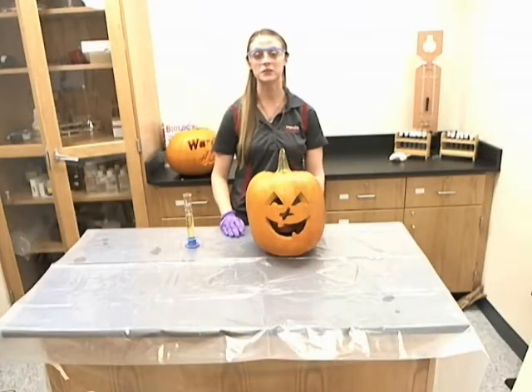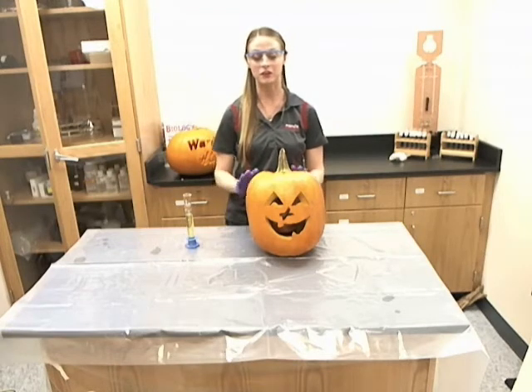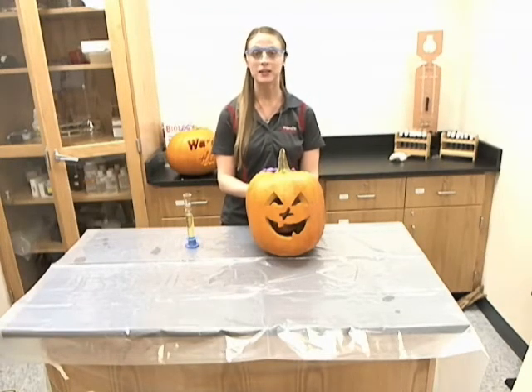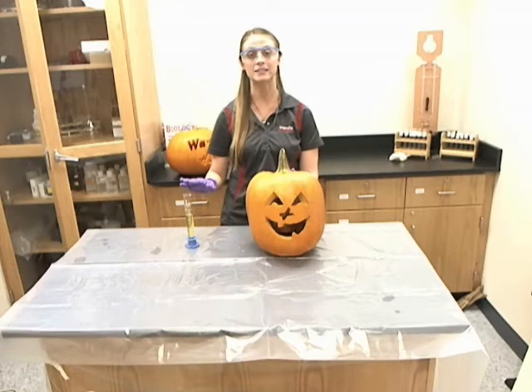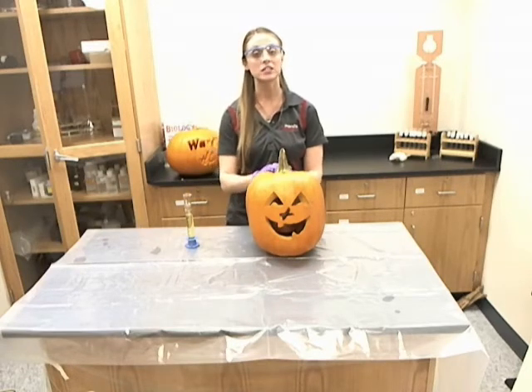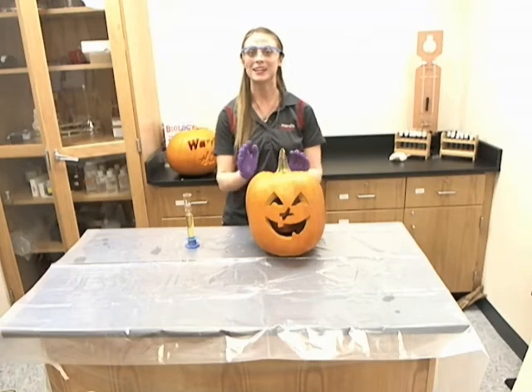Now that you've seen how this reaction is typically performed, we decided to make it a little more fun for Halloween. We got an actual pumpkin, carved it, and placed a beaker inside containing all of the reagents apart from the potassium iodide. The only change we made was tripling all of the volumes used. Let's see what happens.